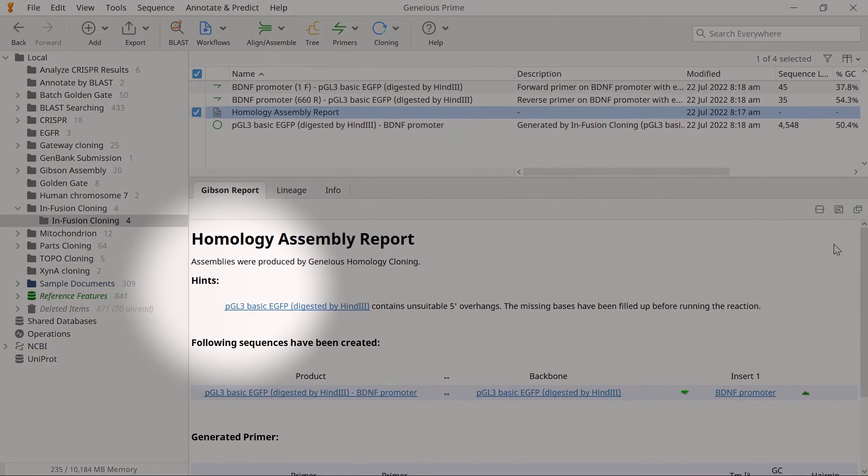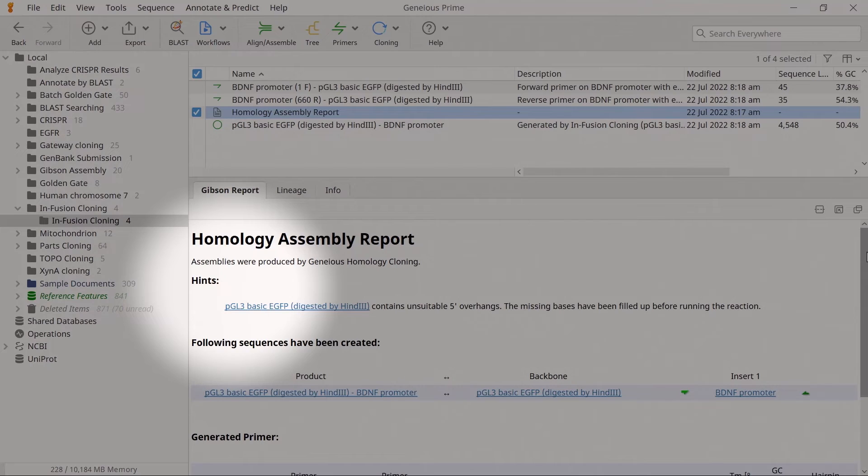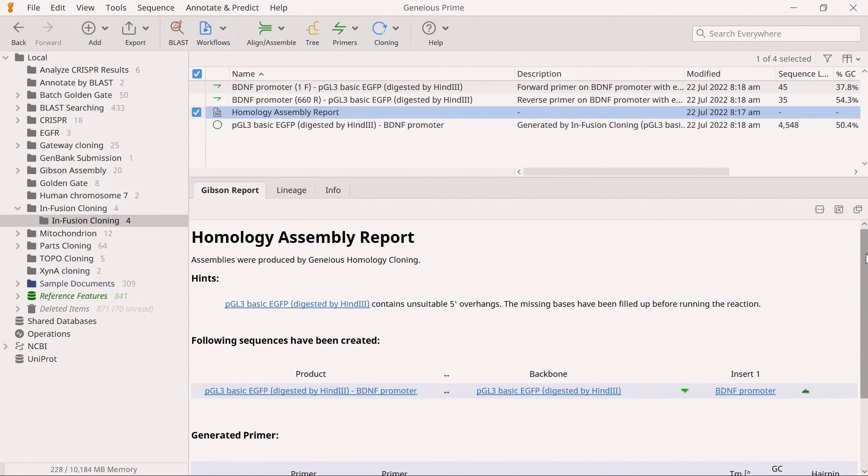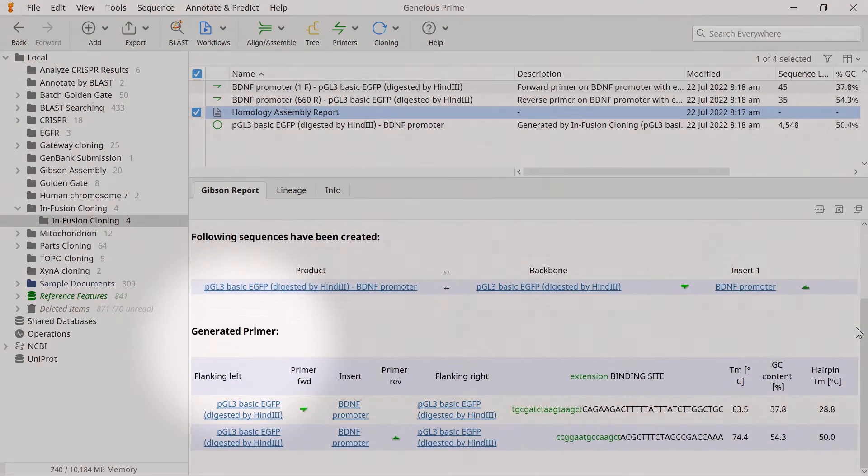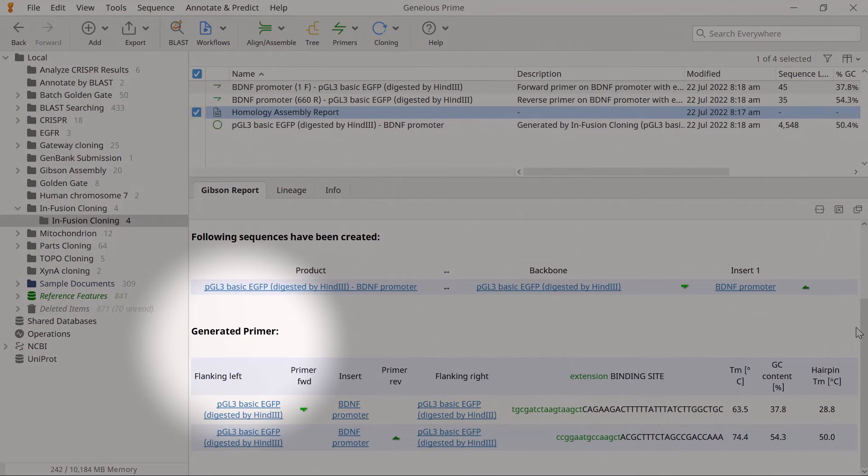The Hints section lists any manual modifications to the primer sequences, such as the addition of bases. And within the Generated Primer section of the report, the forward and reverse primer sequences will be listed.